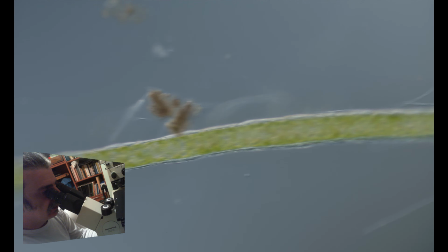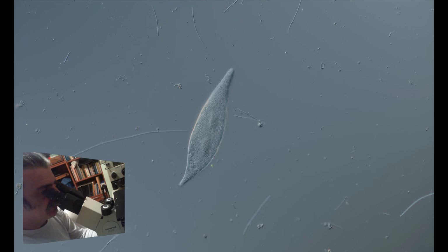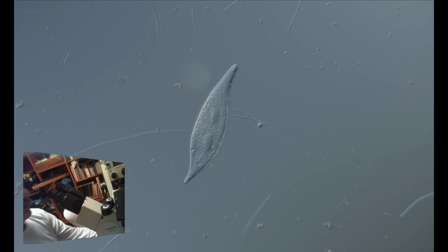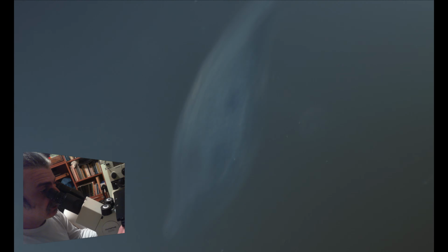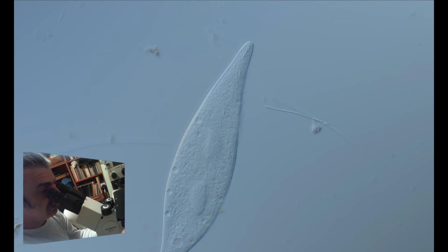The ciliates are Trichodina, and they live in a commensal sharing, but not here. Okay, we've seen here another beautiful ciliate. This one's called Lionotus. I think it's time to switch to the 40x so we can get more detail.